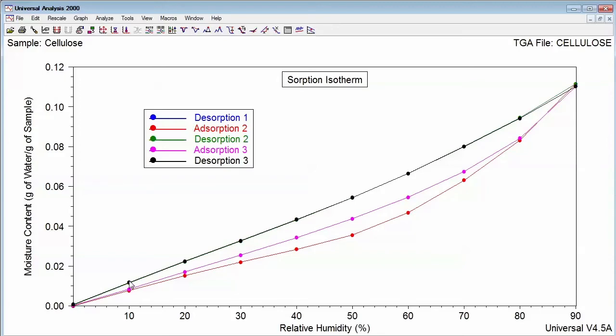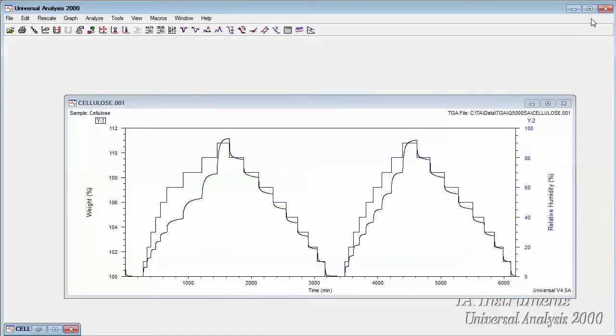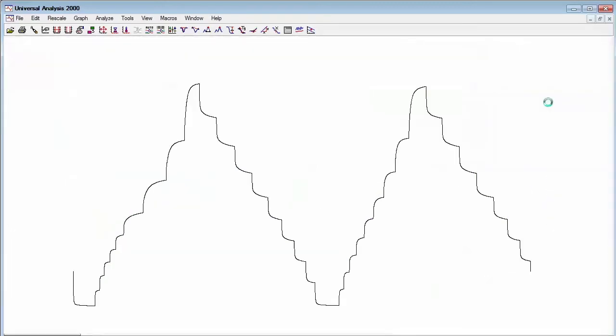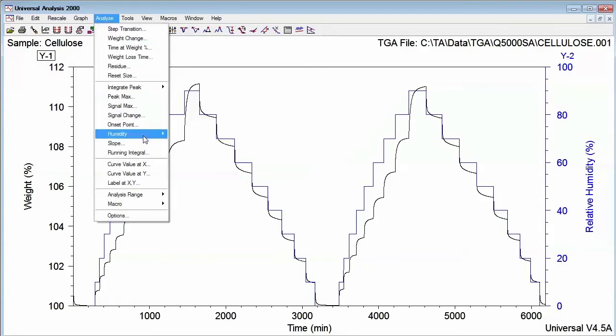In addition to generating a Sorption Isotherm plot, you may also perform various analysis for surface area analysis using the BET or GAB models. In universal analysis, we have generated a Sorption Isotherm using a Q5000 SA data file.